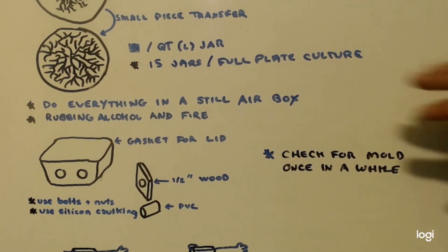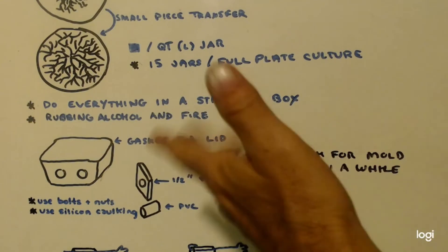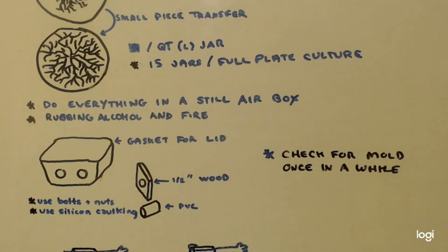So back to the video. We're going to have our mycelium — no matter if we have one plate or ten plates — and we're getting ready to spawn. I showed how to sterilize and hydrate the grains in the last video. So they're already in a jar with a lid on it and tinfoil over it, sterilized and ready to go. All you have to do is put it in the still air box with your petri dishes, cut out a sample about the size of your fingernail, heat up your knife until it's red hot, dip it in clean agar so it's not hot, cut out a chunk of mycelium, and throw it into the jar. Put the lid back on and tighten it all the way down until you're completely done with all your jars.